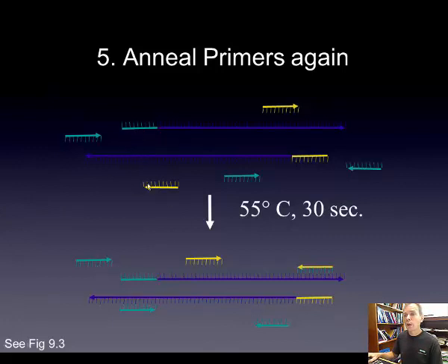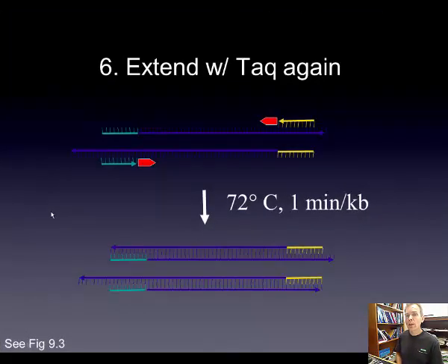The forward and reverse primers now are binding, and the Taq DNA polymerase is now extending. Only some of the templates are shown here for clarity. Notice, however, that some of the templates have ended here at the forward and the reverse primer. So the subsequent products will only be generated that extend only to the forward and reverse primer ends.